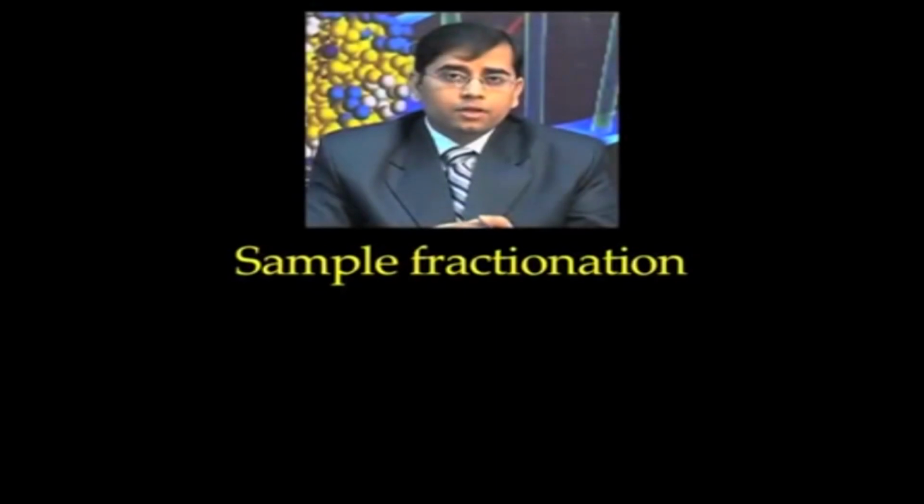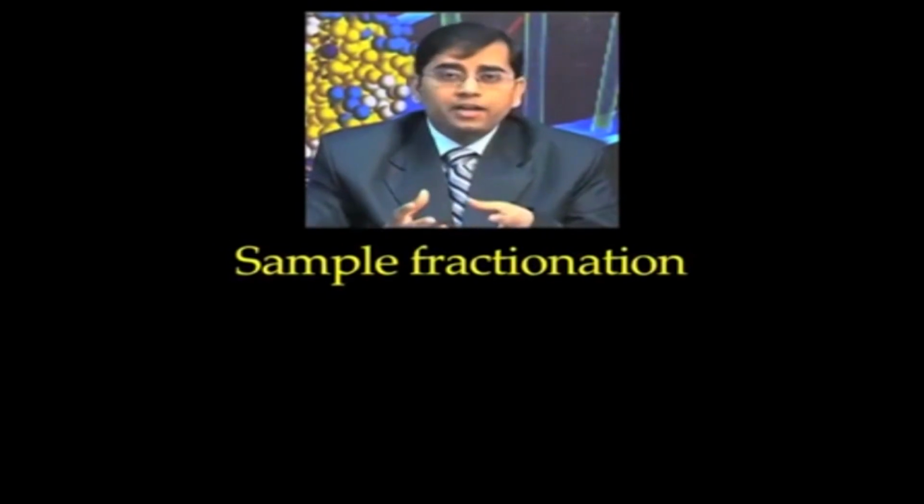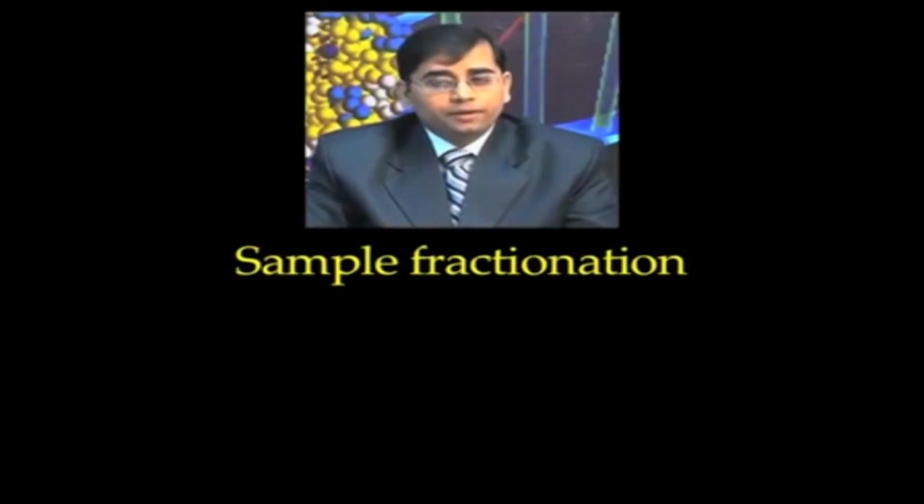Now, let us talk about sample fractionation. As I mentioned in the beginning, depending upon your application, you need to decide on a strategy, an effective way of obtaining all the proteins, so that you can study your biological problem effectively.